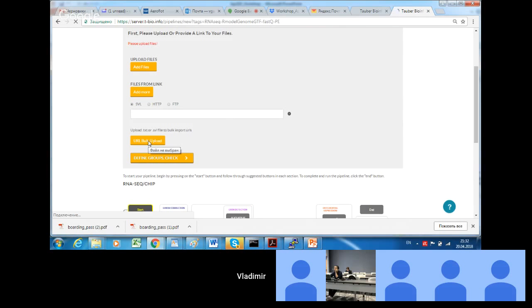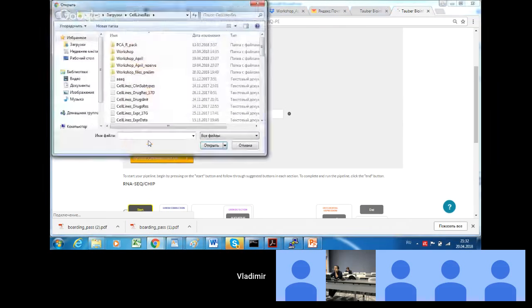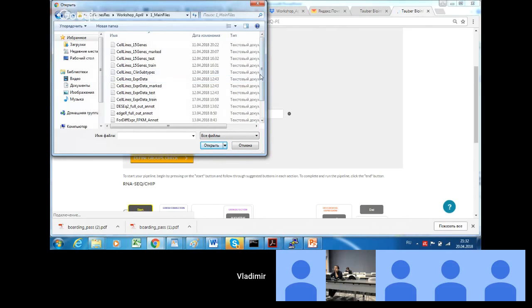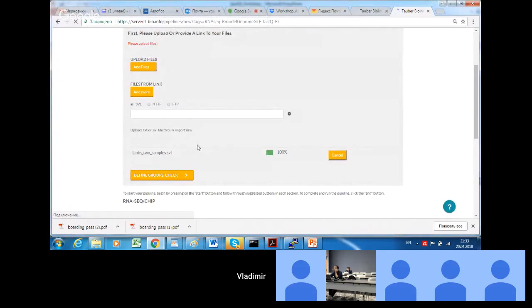So we can select the option bulk upload, and from the file list we have, specifically from the folder main files, we can select a link to files that are already present. For example, links to samples will give us a link to 2 samples we have. So we open these files and go on.